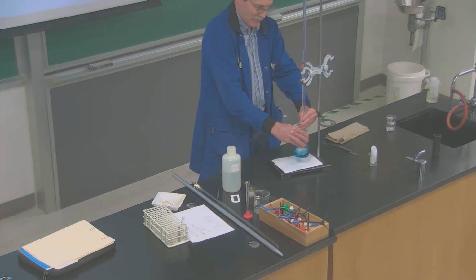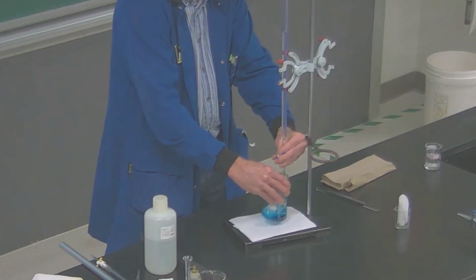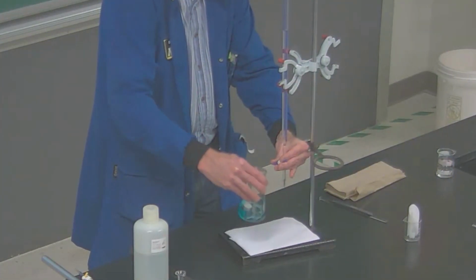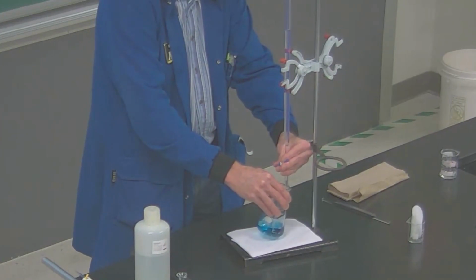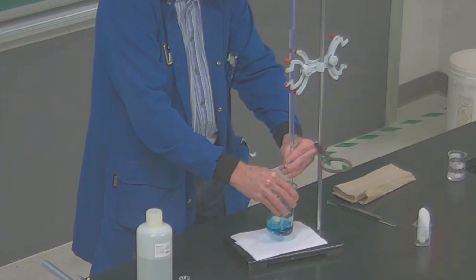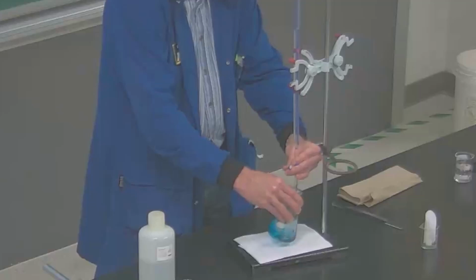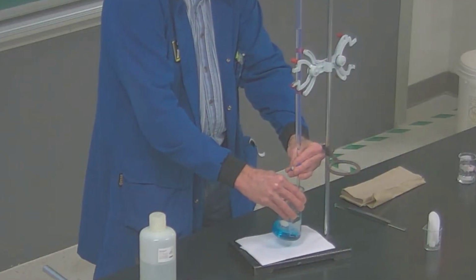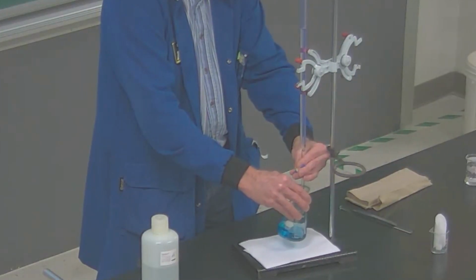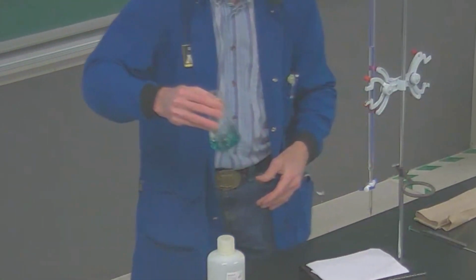See, it's just about persistent. So I think I may have just, nope, not quite. So you can see it was almost there. I'm going to add just a drop and see if we can get this to just that green color that you see in between. The green is the ideal, but if you do go over a little bit, this reaction is somewhat forgiving in that it will throw off your mole ratio of nickel to ethylenediamine just a little bit. But remember, it's a whole number ratio.